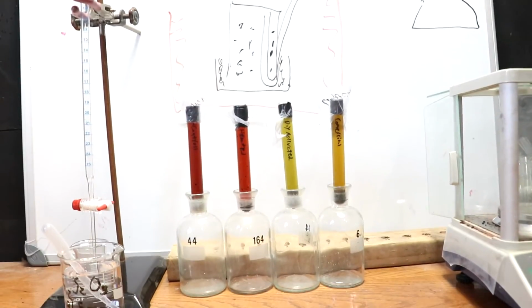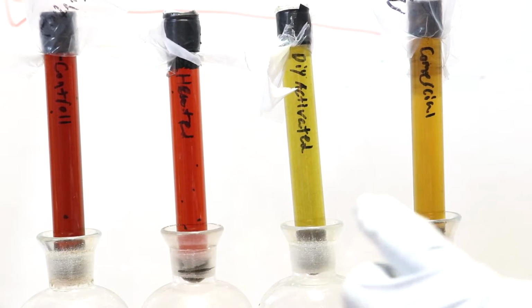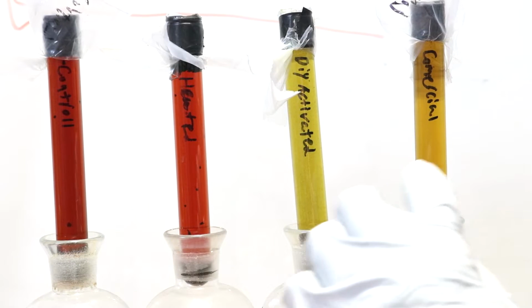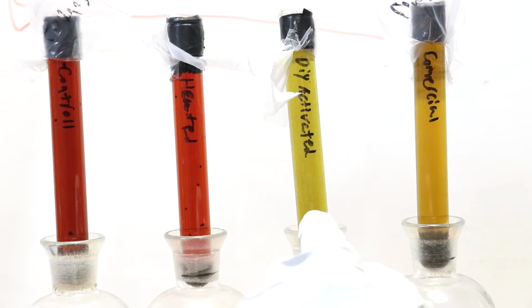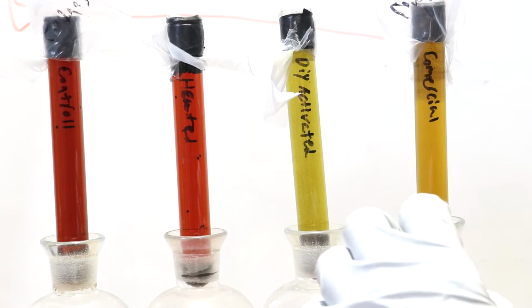Okay, so it's the next day. These have sat for about 12 hours. And you can already see that the activated carbon test tubes are significantly lighter than the non-activated carbon test tubes. This would indicate that they have absorbed significantly more iodine. And in fact, my activated carbon appears even lighter than the commercially activated carbon, which would indicate mine's better.